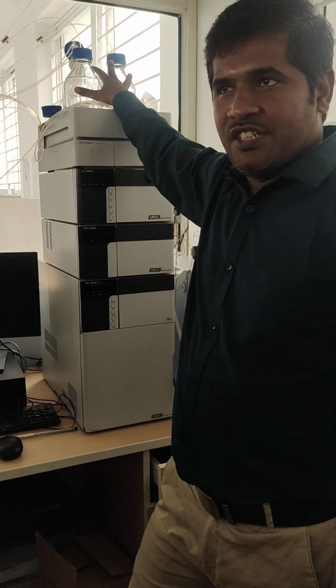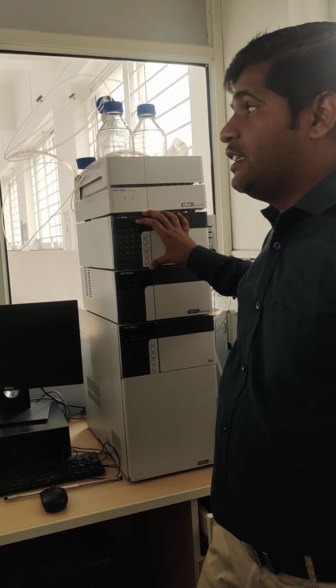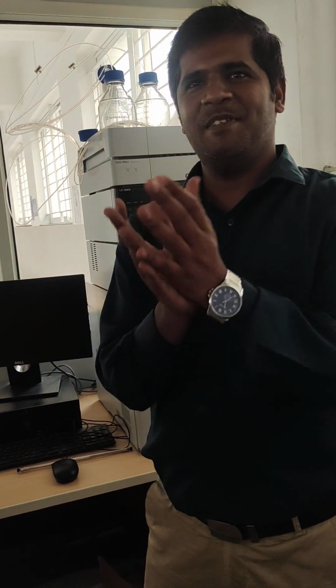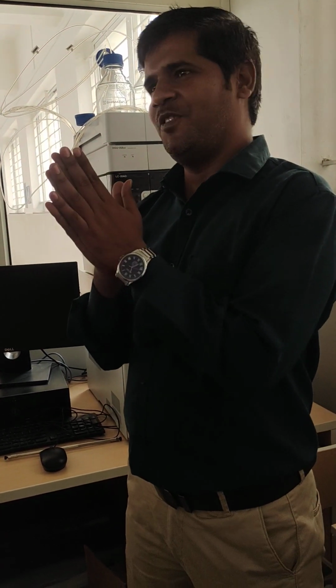Now, gradient system, I hope you are understanding. Then the pump. There are 4 types of pump. How many? 4. One is single pump. Second one is binary pump. Third one is ternary pump. Fourth one is quaternary pump. Okay. What is meant by single pump? Only one pump. Binary means 2 pumps. Ternary 3 pumps. And quaternary means 4 pumps.